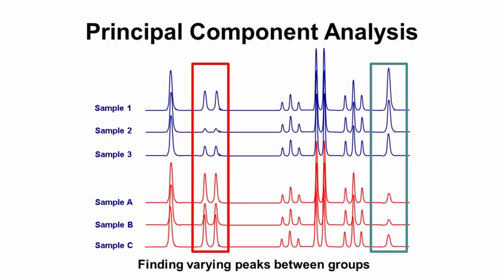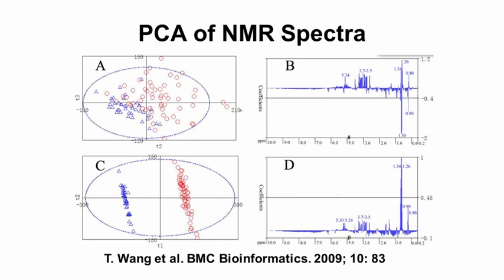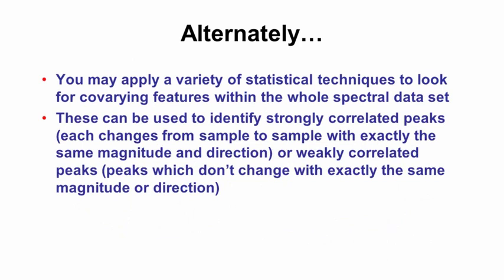So in this regard, we can do multivariate statistics. We can identify those differences, and then we can highlight them in these graphs that show the variations and the degree of correlation or differentiation. So we've regenerated the spectrum, regenerated the plots, and in many cases we'll color those plots to show where those variations are greatest.